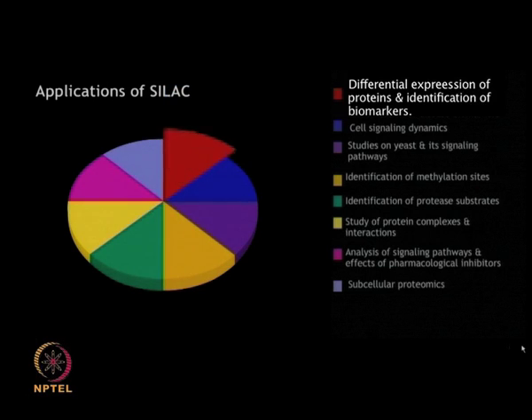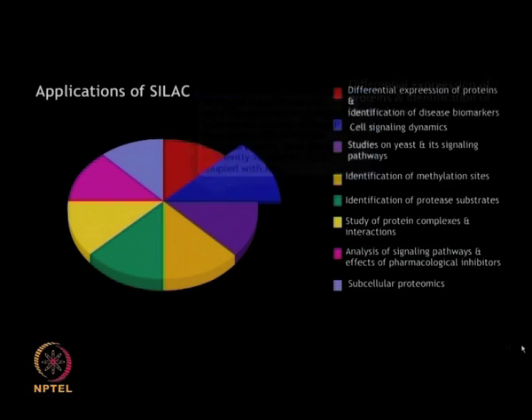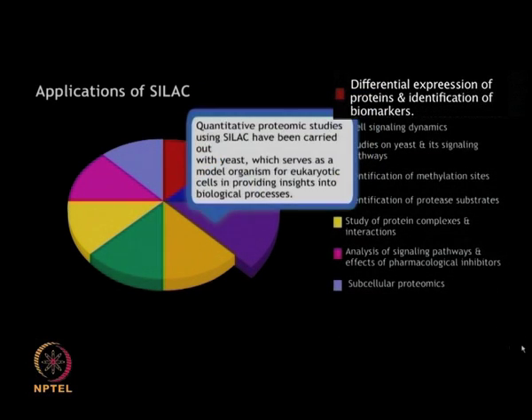The temporal dynamics of cell signaling pathways, which transmit information through various post-translational modifications, most commonly reversible phosphorylation, have been efficiently studied by using the SILAC method coupled with mass spec.